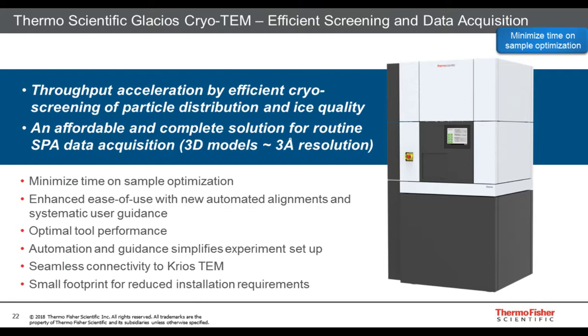That is what we call the autogrid ring. This autogrid ring is loaded into a cassette, and the cassette actually can be transported in what we call a capsule covered in liquid nitrogen to one microscope, the Glacios. So the autoloader and the autoloader components, which is the grid, they basically ensure the optimal mechanical connectivity from the screening microscope to, if needed, the high resolution microscope.